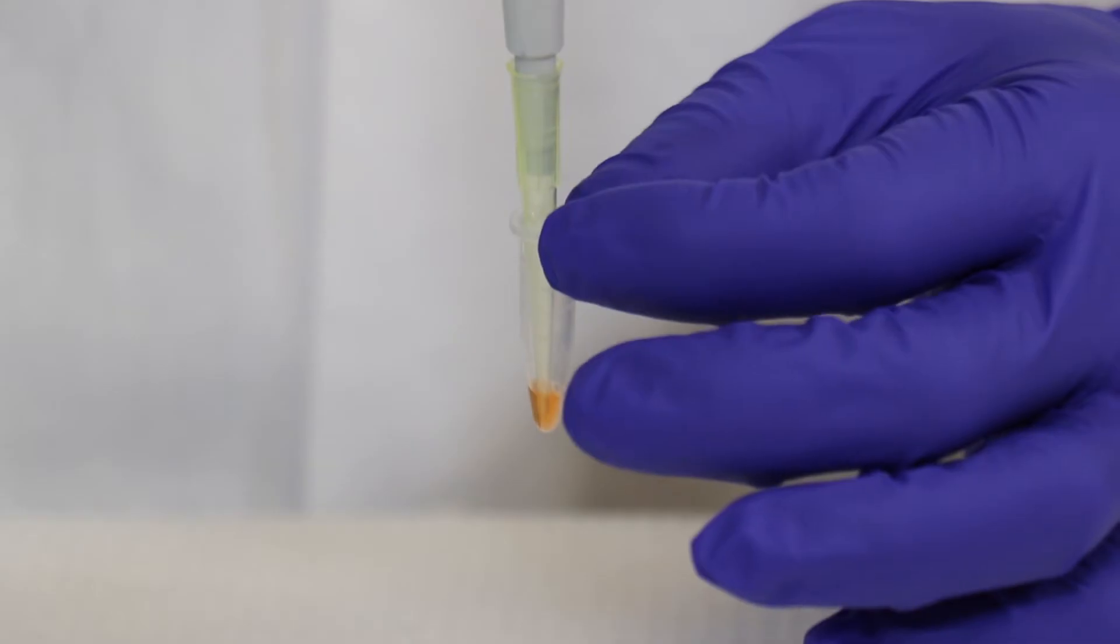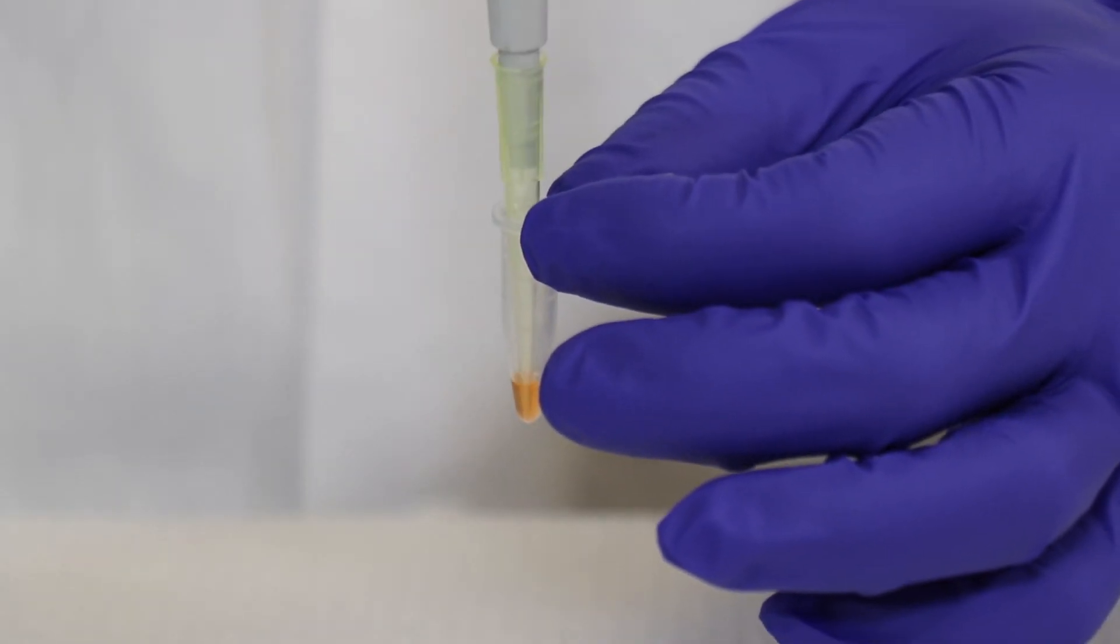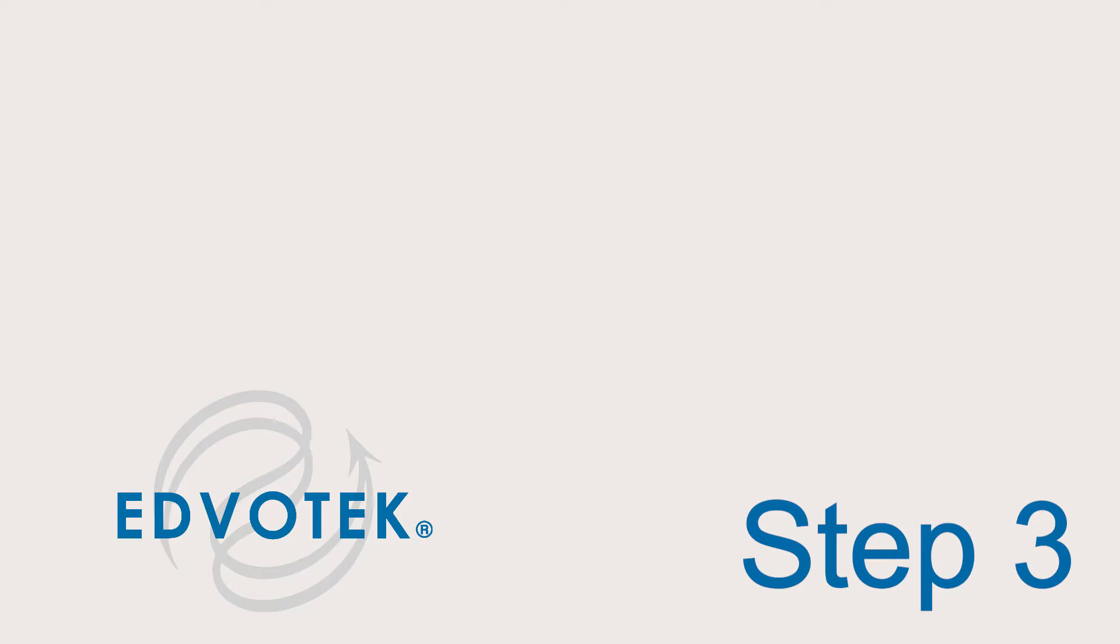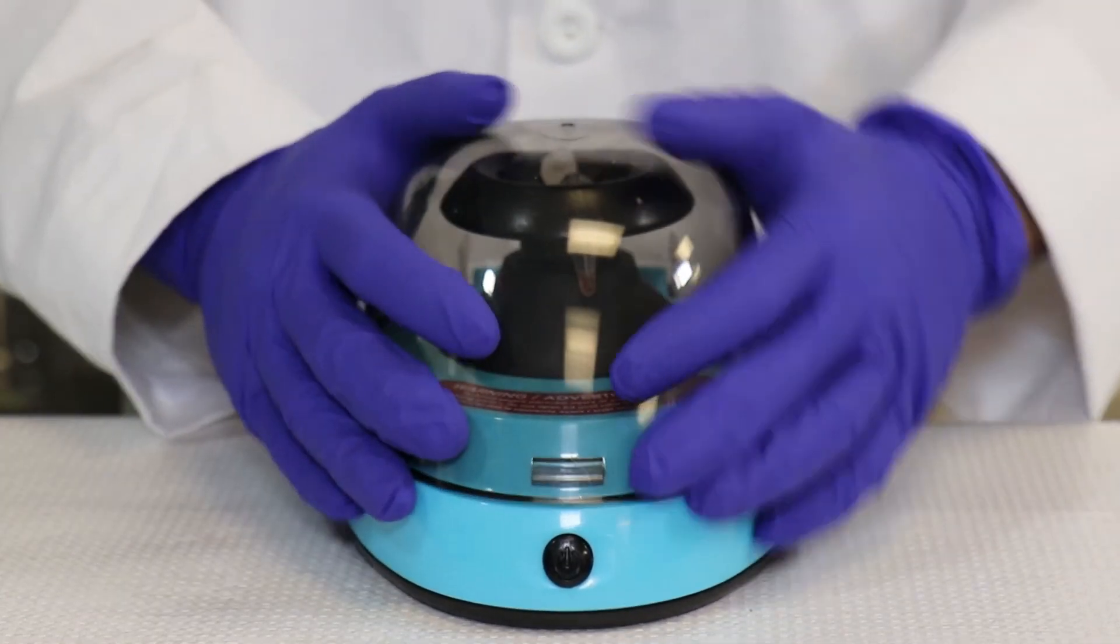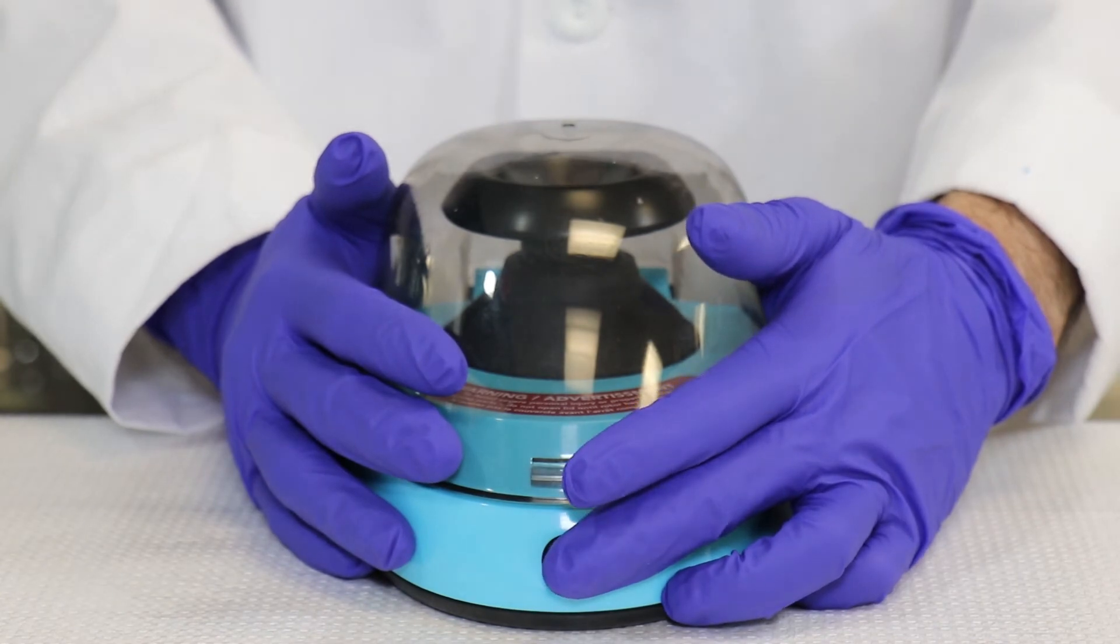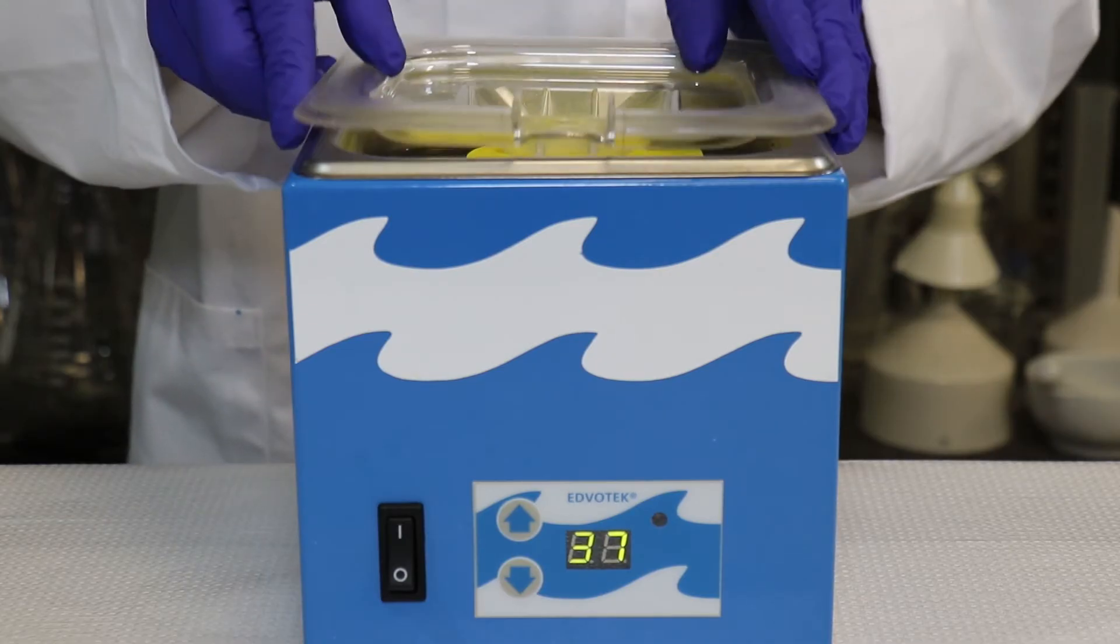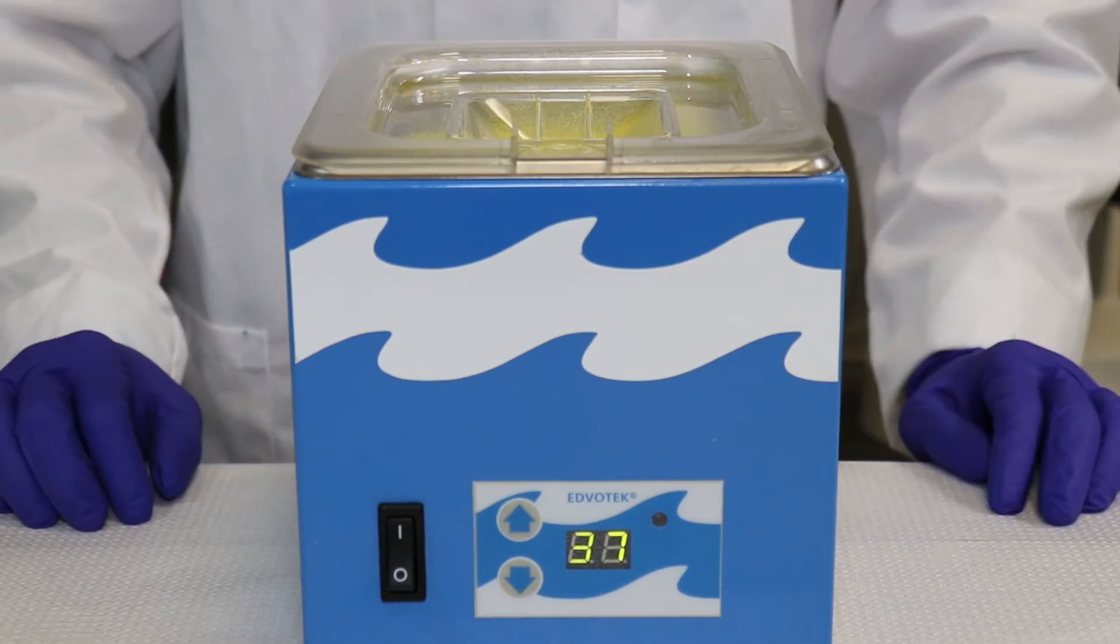Step 2: Gently mix the restriction digest Hae3 tube. Step 3: Quickly centrifuge to collect the sample at the bottom of the tube. Step 4: Incubate the digest for 30 minutes at 37 degrees Celsius.